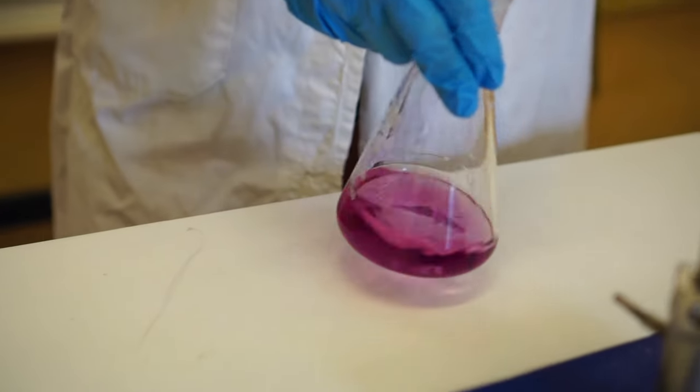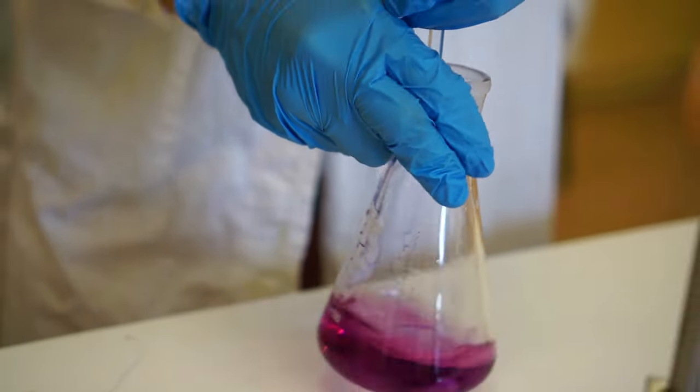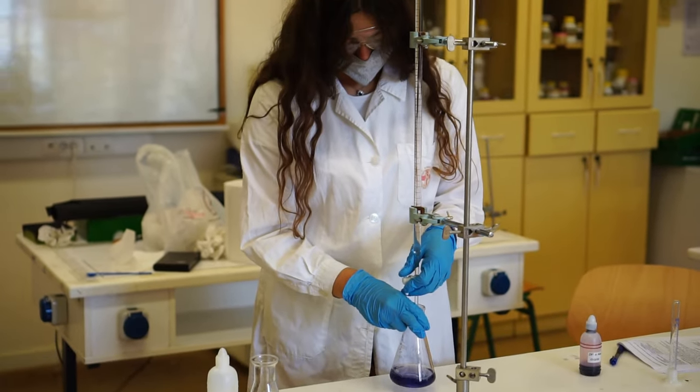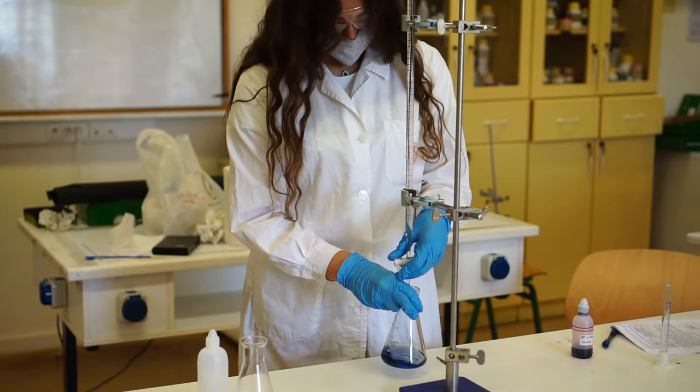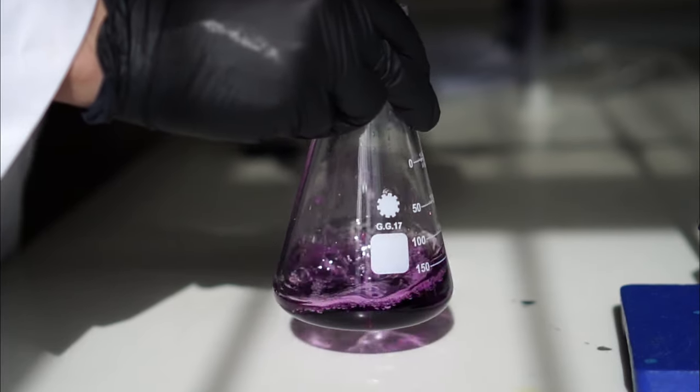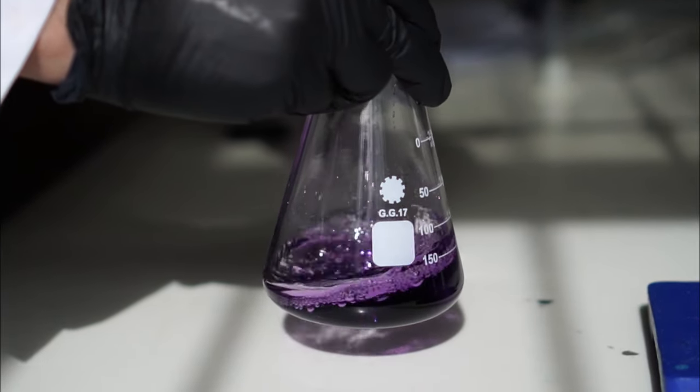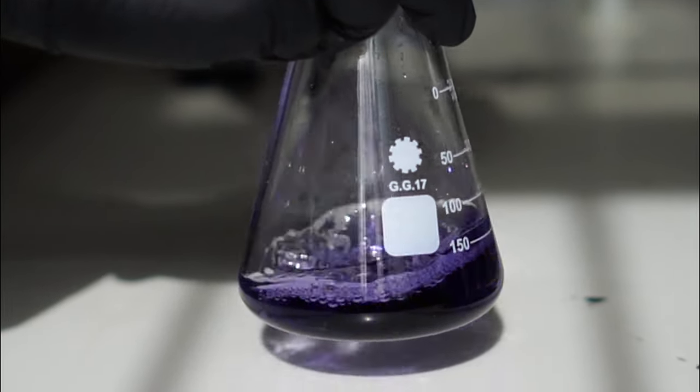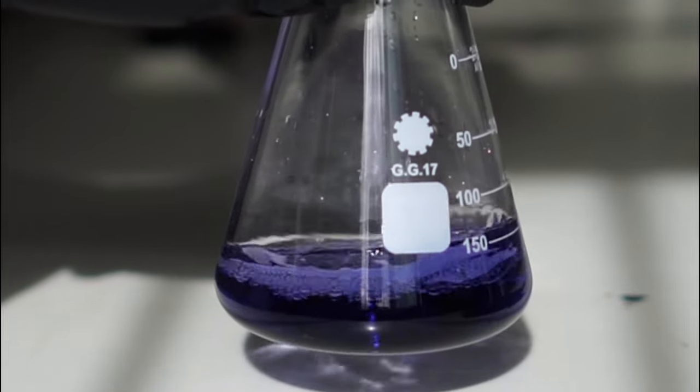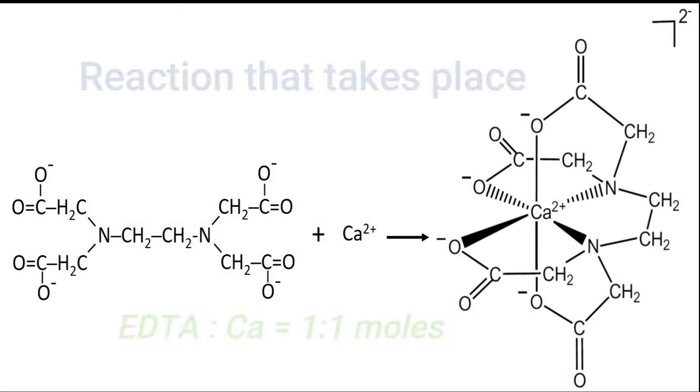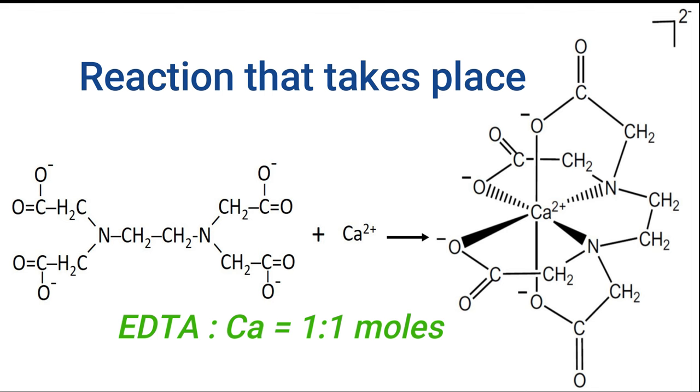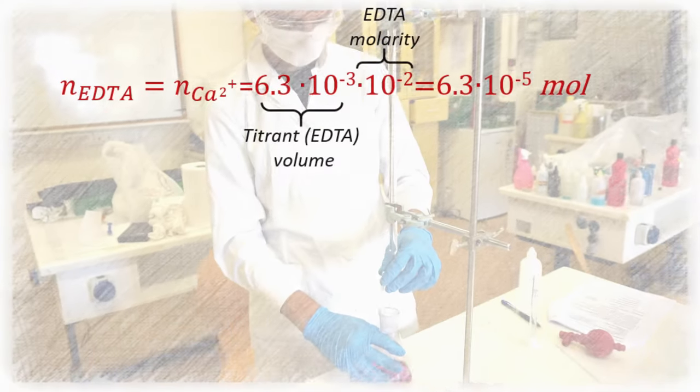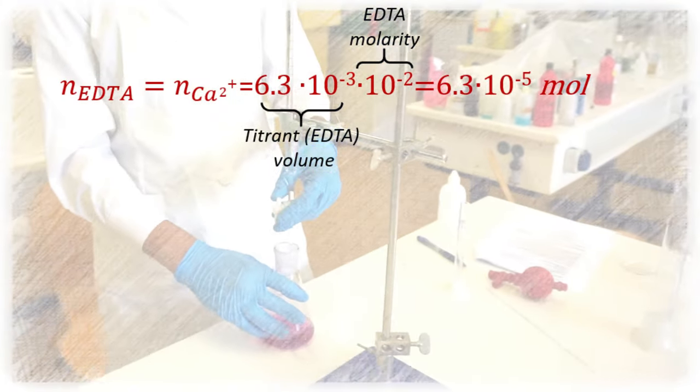When approaching equivalence point, EDTA must be added very slowly. With some slow motion footage, it is easier to follow the sequential color changes. Normally, we perform 2 or 3 identical titrations and use the mean value of EDTA volume for our calculations.